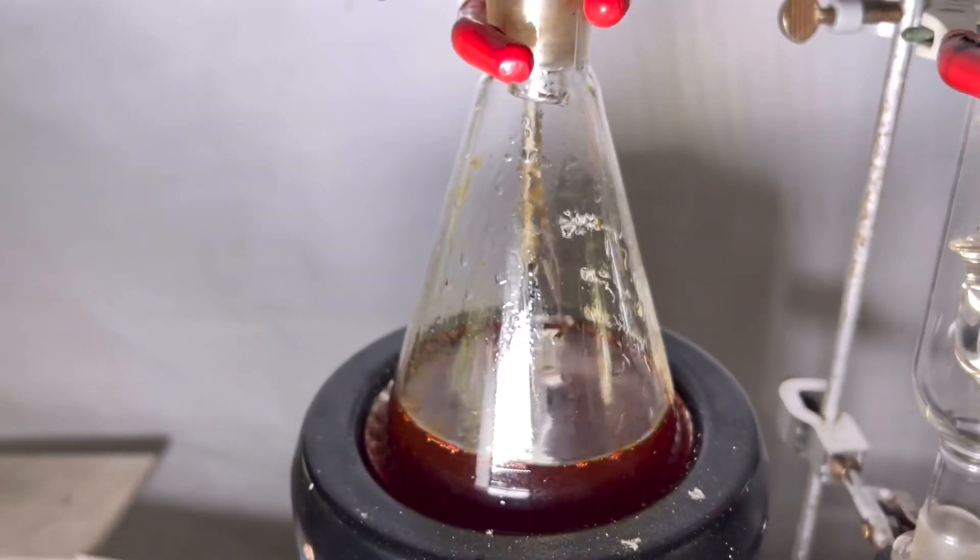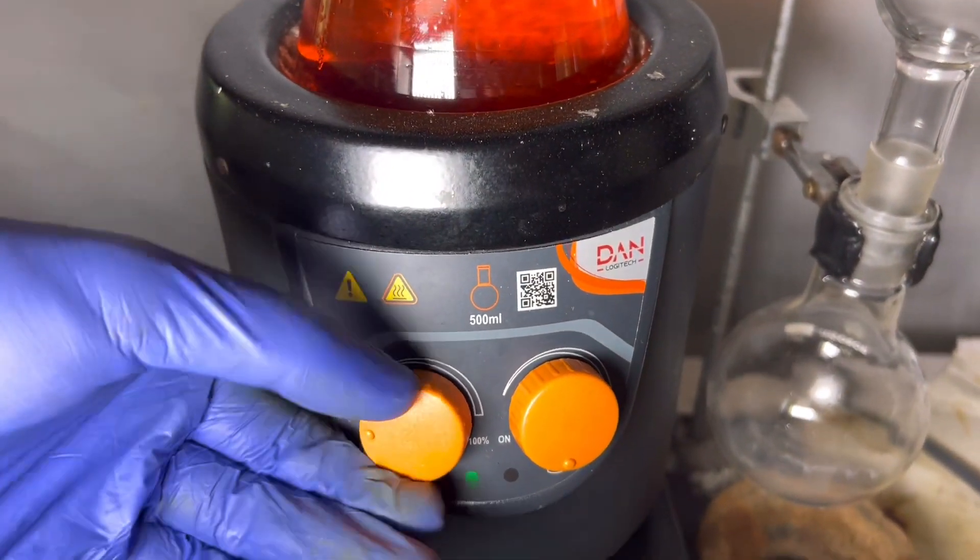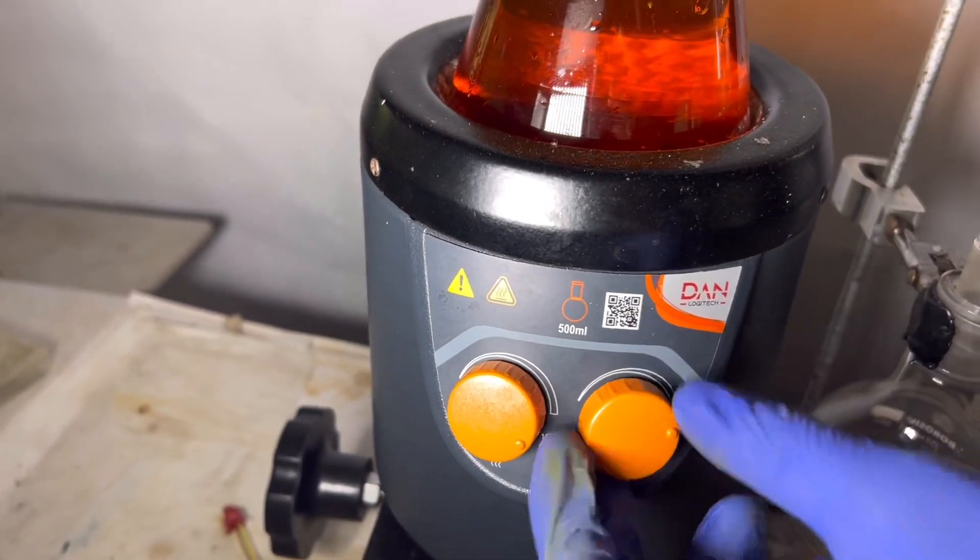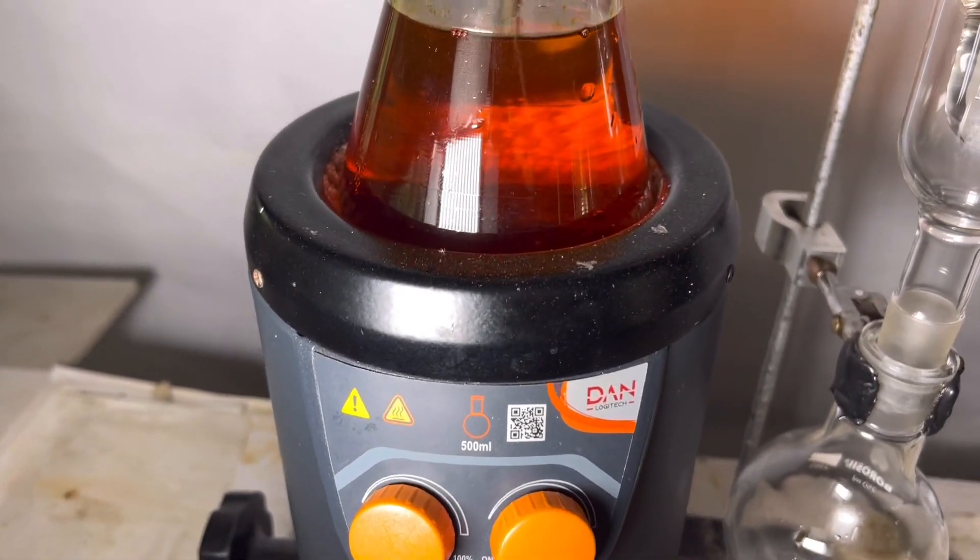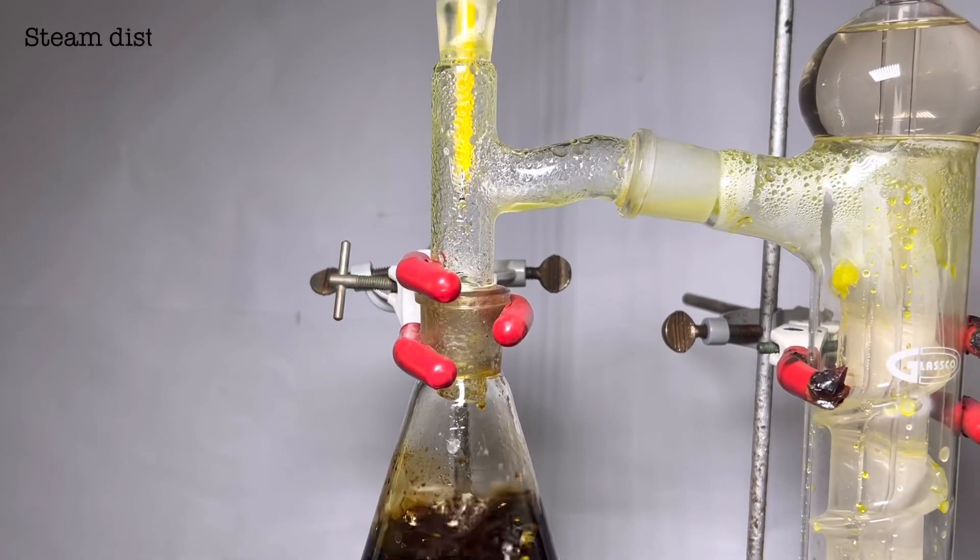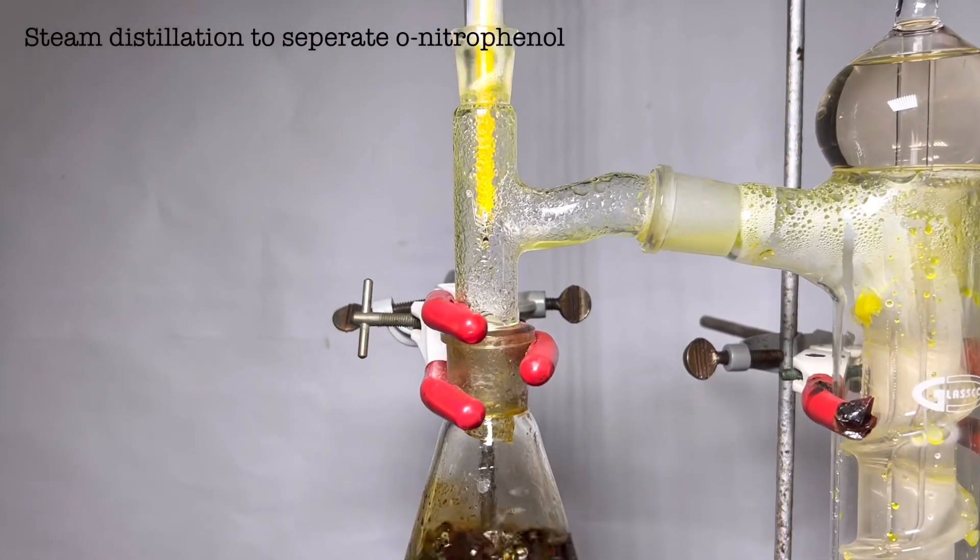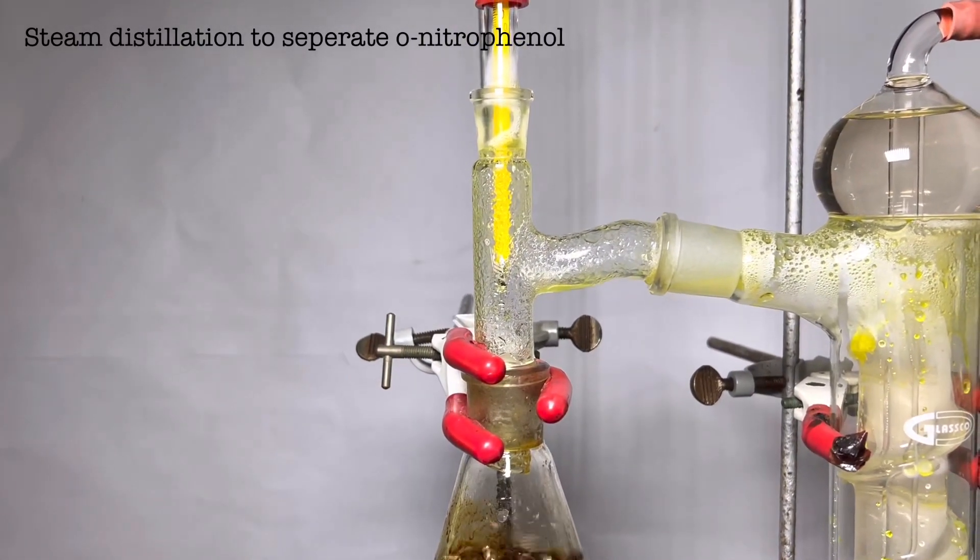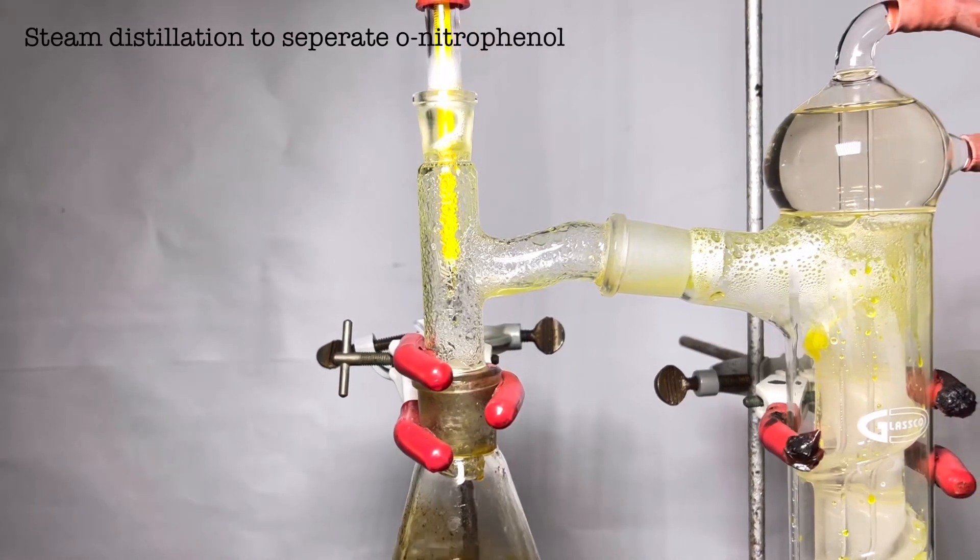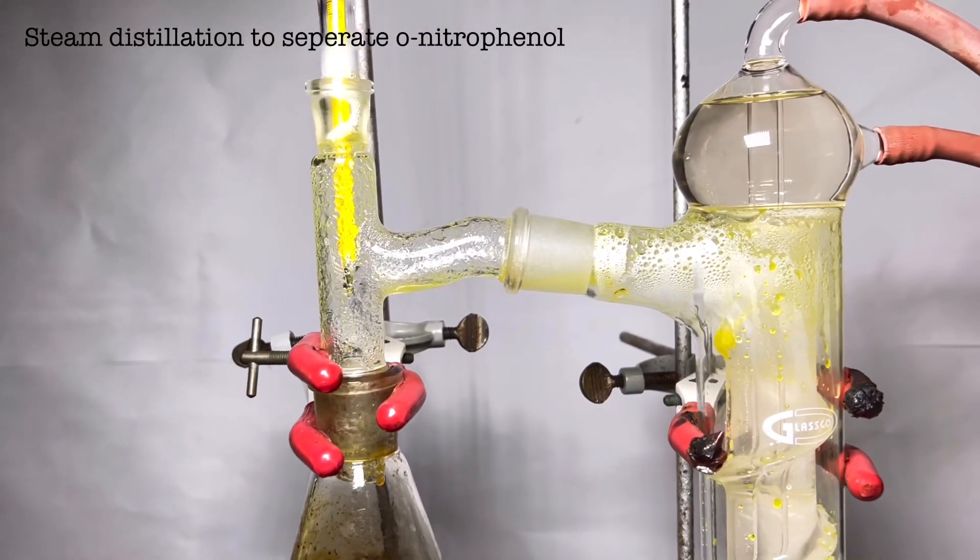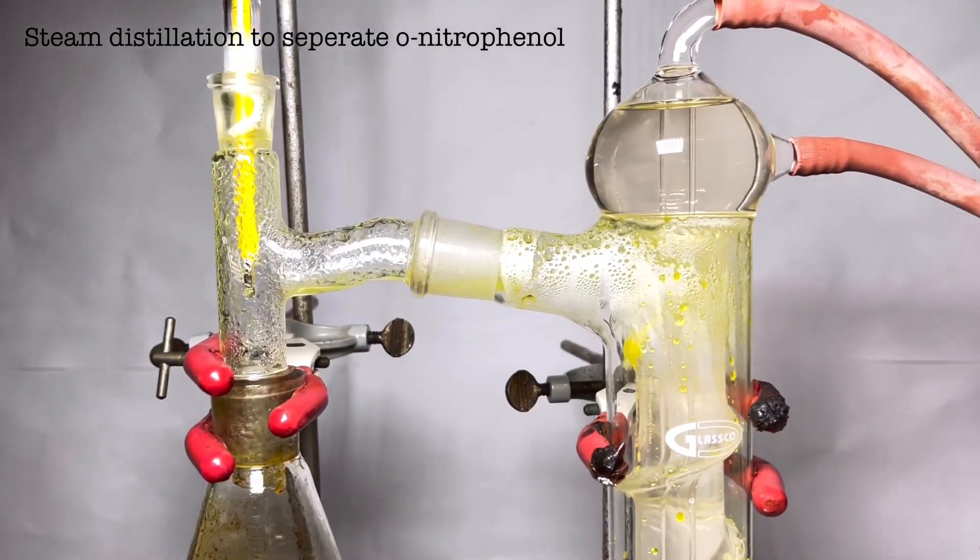We will be performing a steam distillation. Separation of ortho and para-nitrophenols by steam distillation is possible because the ortho compound contains an intramolecular hydrogen bond between the oxygen of the nitro group and the hydroxyl group in the ring. The para isomer is associated with intermolecular hydrogen bonding. So ortho-nitrophenol will distill over with water and the para-nitrophenol would remain in the distilling flask.